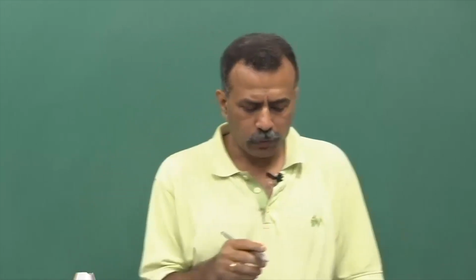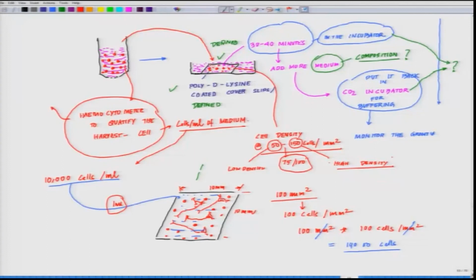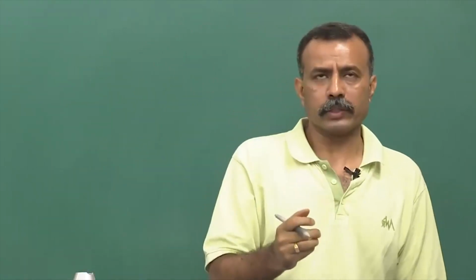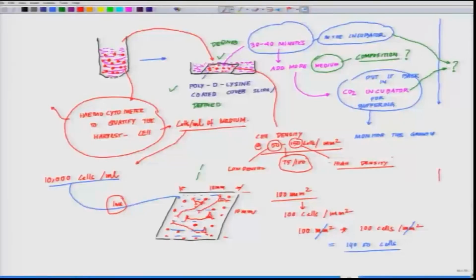Okay. So, this hemocytometer calculation, you can pull out from any manual where they do blood analysis; it will tell you how much you have to put and how many cells you are seeing. Fair enough. So, you plated the cells.